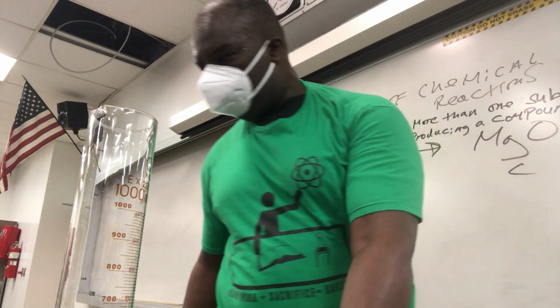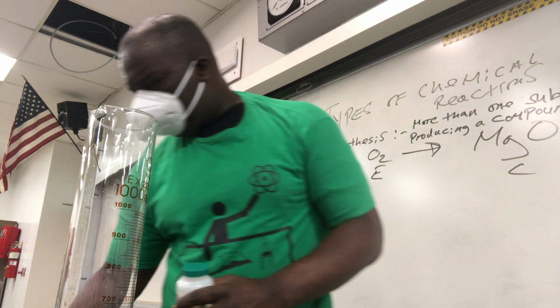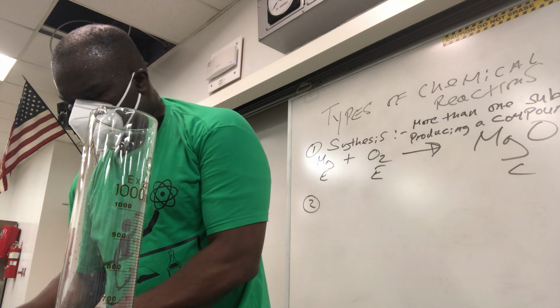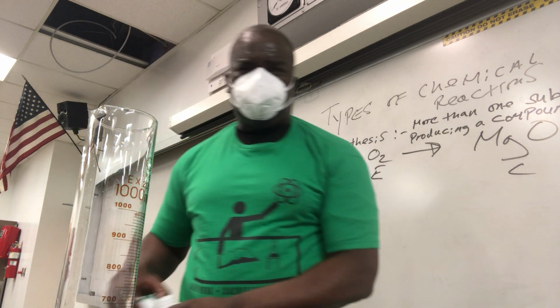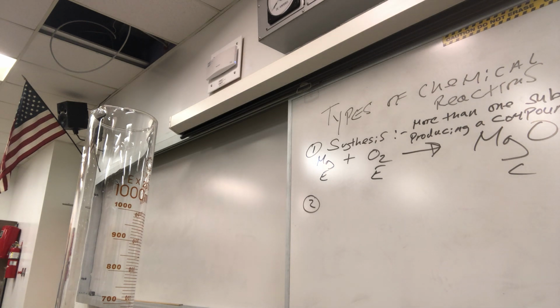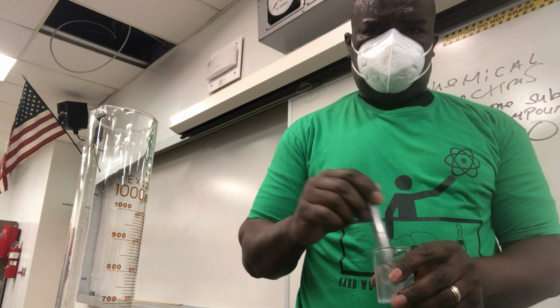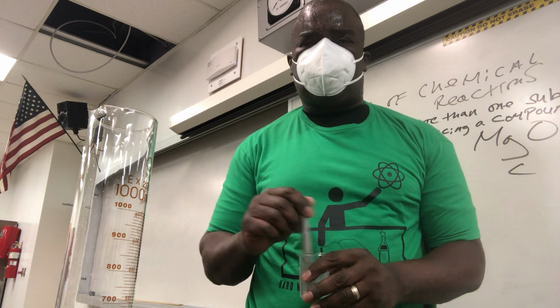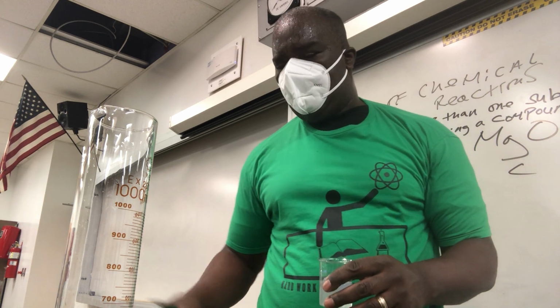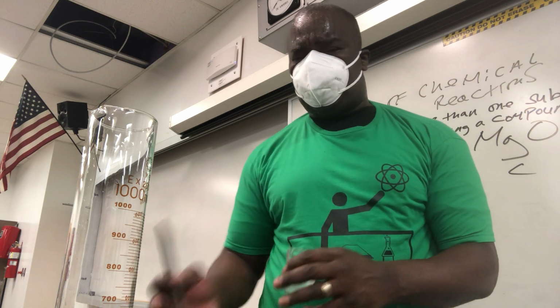Okay. Alrighty. Now, what I'm going to do? Got a beaker. My potassium iodide. Got my scoopula. I'm going to put some in the beaker, and I'm going to make it aqueous. You can put it in as a solid, but I find when you put it in as an aqueous solution, it's better in terms of the rate of reaction. Okay, got my water. Give it a little stir. So once again, what are we doing, folks? We're starting with hydrogen peroxide, and we're going to add potassium iodide to it. Potassium iodide is our catalyst. The hydrogen peroxide is breaking down as we speak, but very, very slowly. We want to speed the reaction up and see the products.